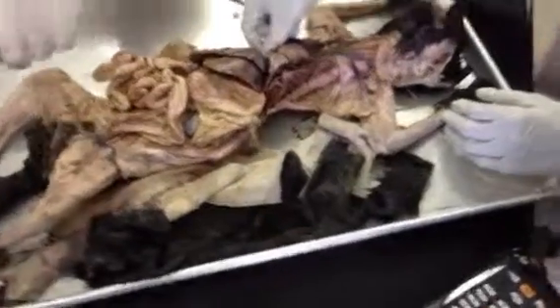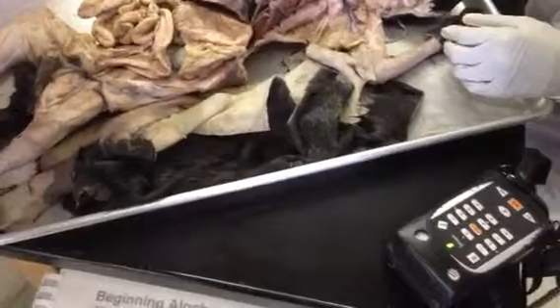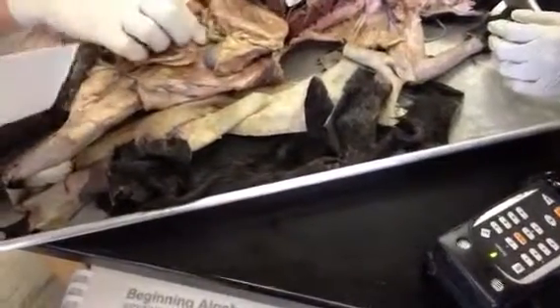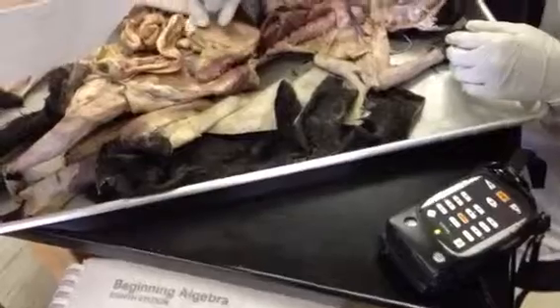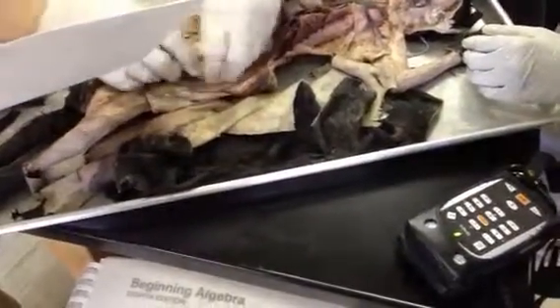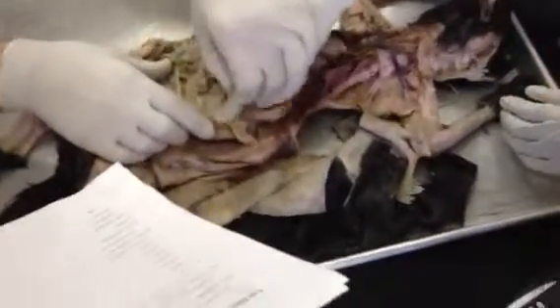What else? Can I take a look at your paper here? My hands are all goopy. So the spleen, I want to show you the spleen. The spleen is hooked onto the greater omentum. So to see the greater omentum, we go back to the stomach. There's the stomach. There's the greater curvature of the stomach. Coming off the greater curvature, and I'm going to straighten it out, this is the greater omentum. All that fatty stuff is greater omentum.